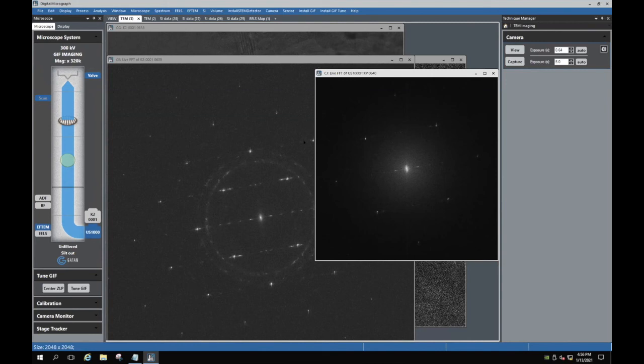But yes, you don't want any beam shift or beam displacement when you change magnification or spot sizes. These are actually key in the case of the Krios. I mean, in general for low dose imaging.